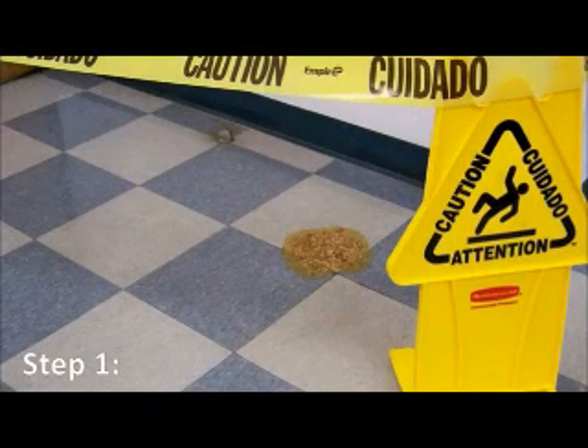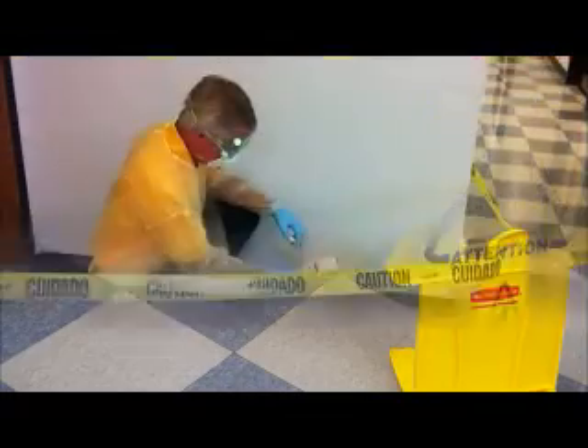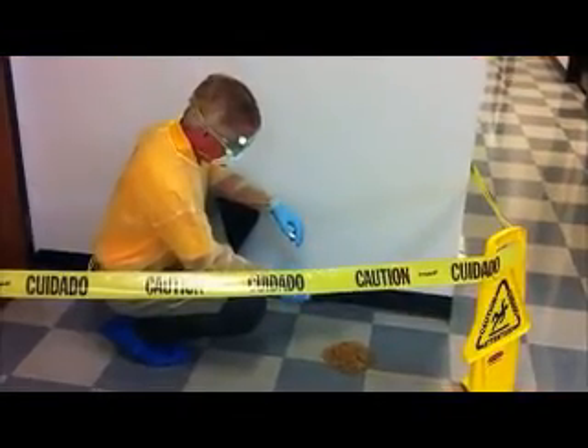Step 1. Secure the area where the incident has occurred and don your personal protective gear which is included in the kit.